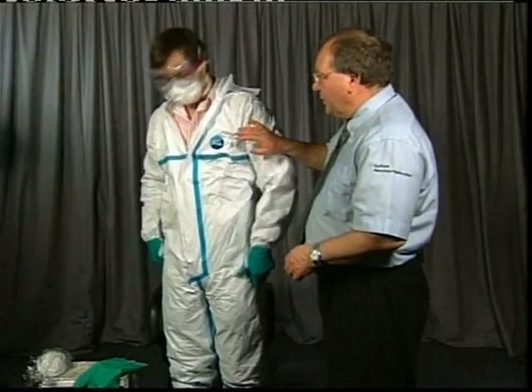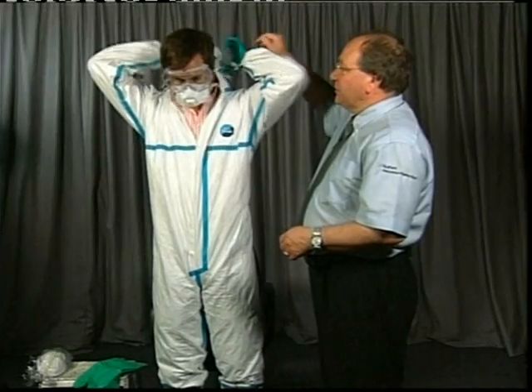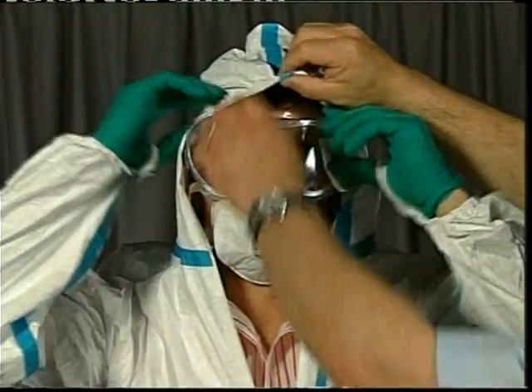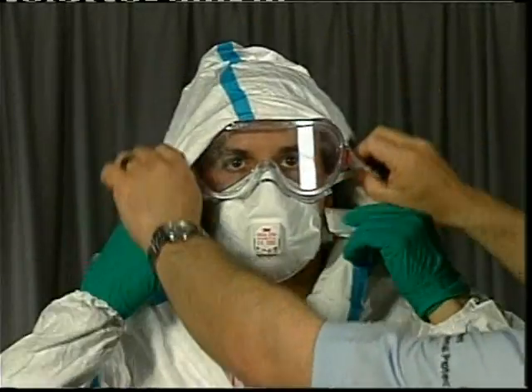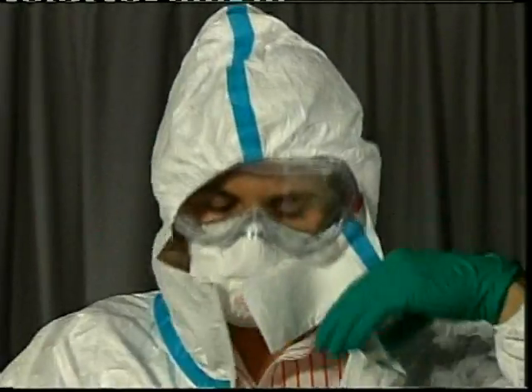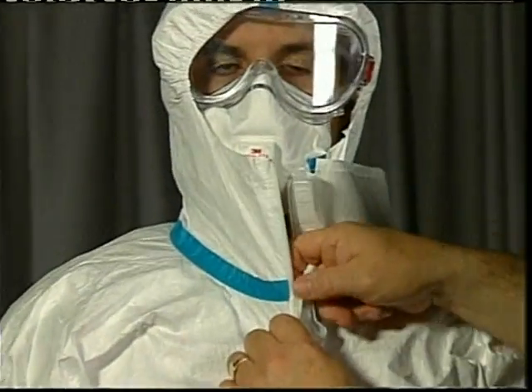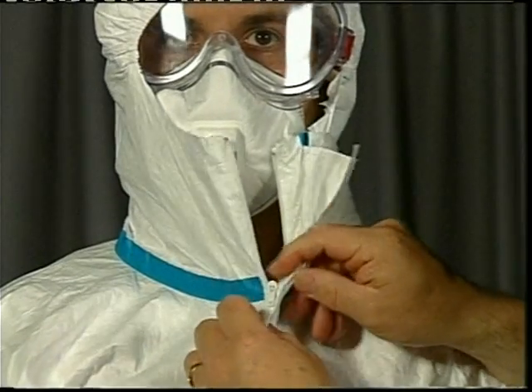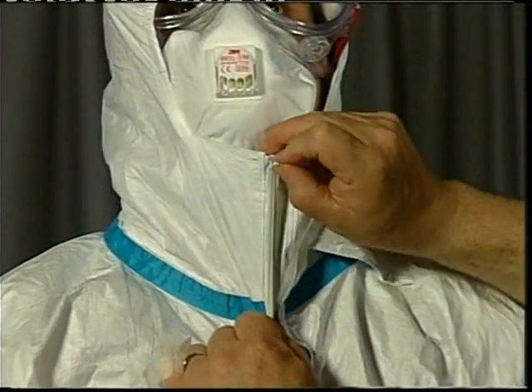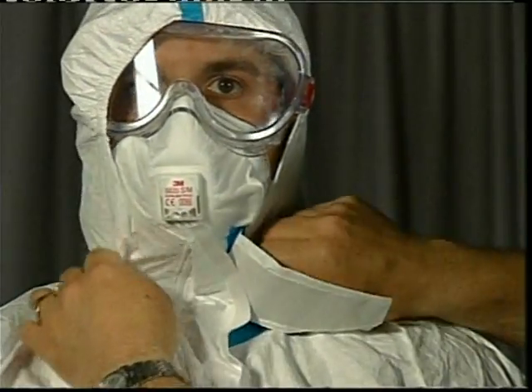Before going any further, dress the hood on the suit by putting the hood over the head first. You want it to come down and fit over the edge of the goggle. Pull the zip up on the garment — the zip on the suit locks and will not slide back down. Lift your chin up. That seals and locks, and we have a fit into the face here.